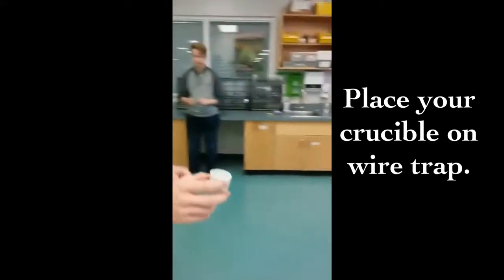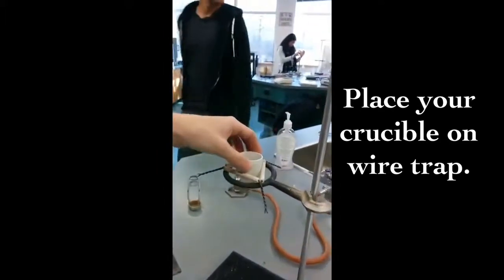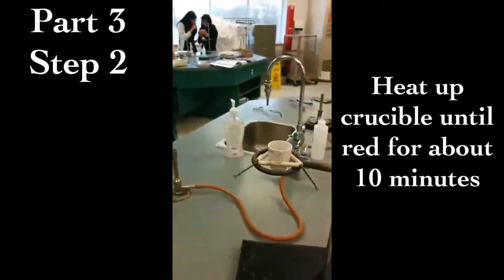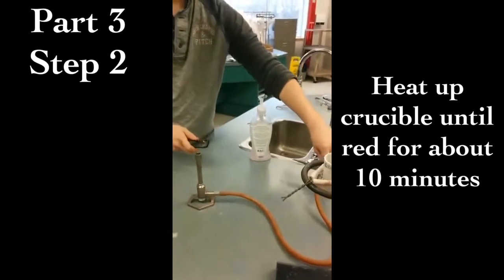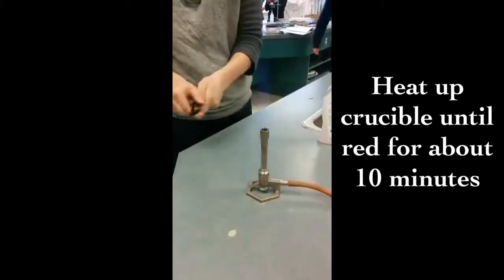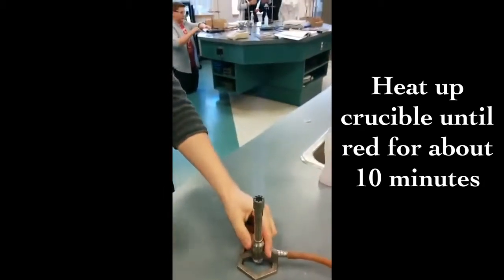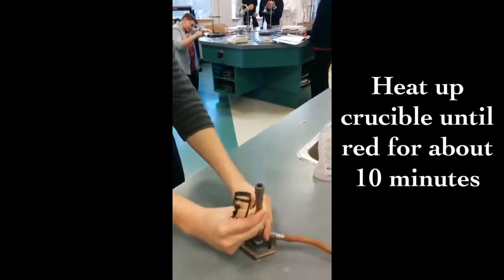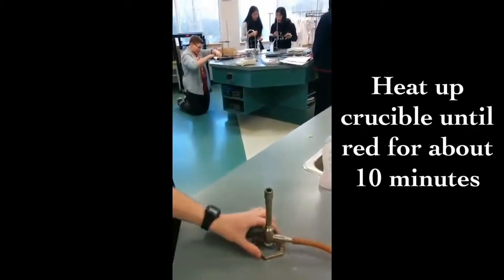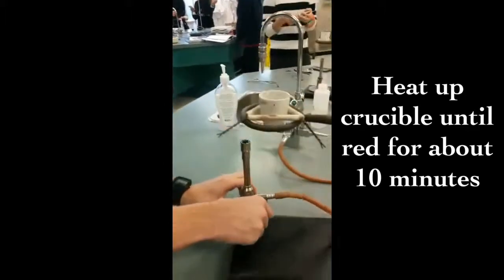Now we have to place it on the wire triangle. Now that we've got our crucible nicely adjusted, it's time to light the Bunsen burner. If the crucible is accidentally cracked while you heat it, it will fly everywhere, and you don't want it to fly into your eyes. Now that it's lit and adjusted, let's put it under the crucible. Be really careful.